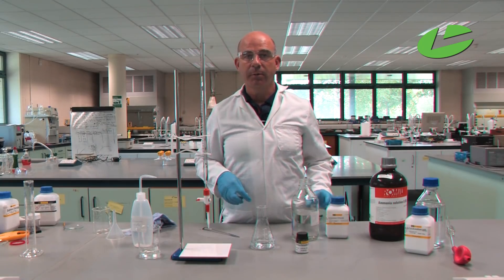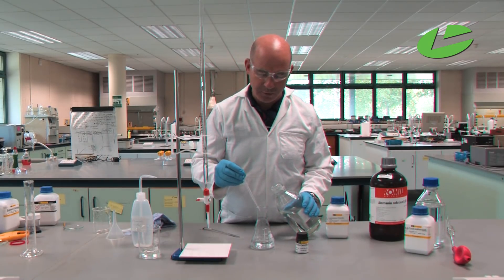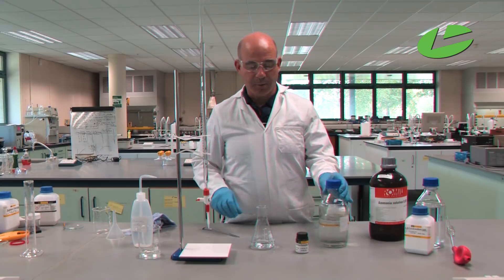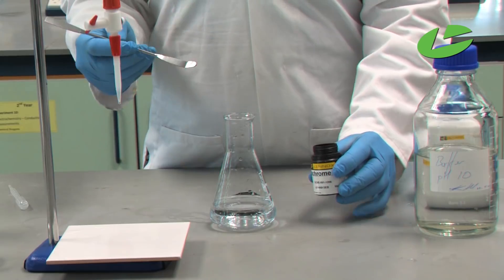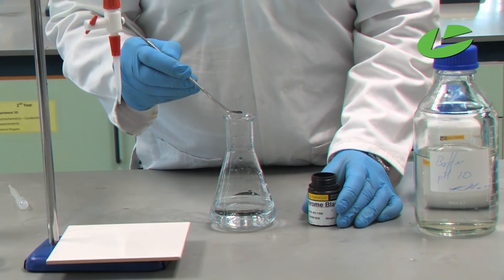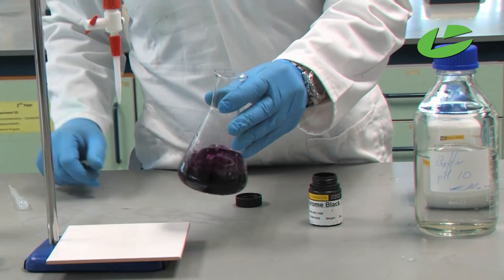In order for this titration to work correctly, you need to add the buffer before the indicator. So I add a few drops of our pH 10 buffer into the solution, then add the eriochrome black T. Only the tiniest amount — a spatula tip — is required. The eriochrome black T turns red when it complexes onto the calcium ions in the sample, and we see a wine-red color.